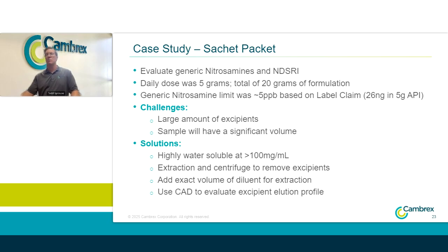And during this development, we did also use a CAD to evaluate the excipient elution profile to mitigate the potential for the excipients themselves to be co-eluting with any of the nitrosamine impurities, which would lead that to winding up potentially within the mass spec, which was something we were hoping to avoid. And we were able to do that. So we reached very sensitive limits. There was a little bit wider variability than most people would like for the method, though, due to, again, the low LOQ that was required.